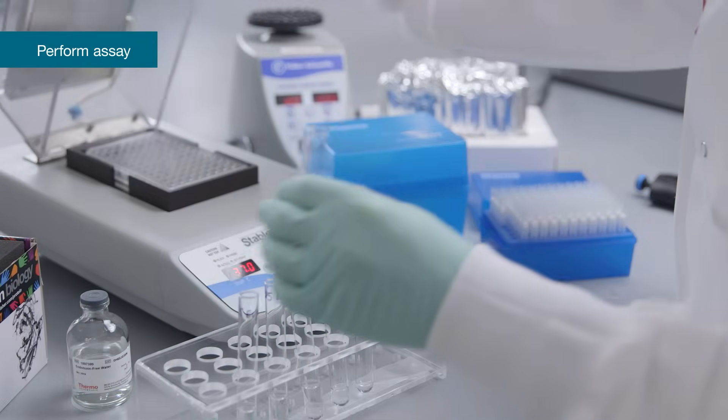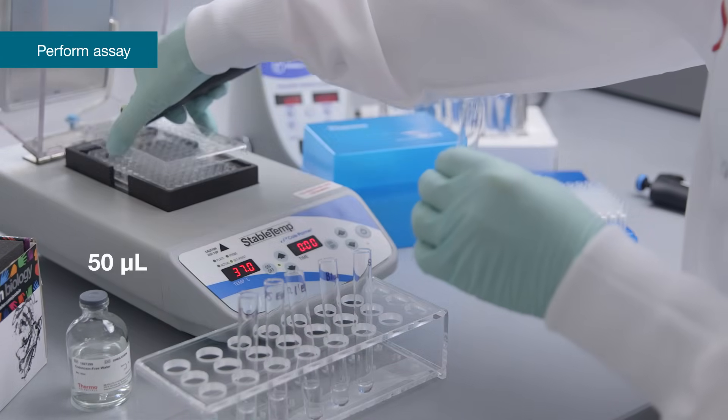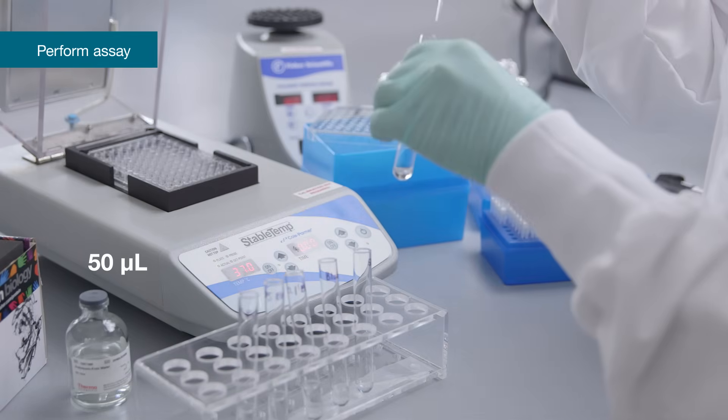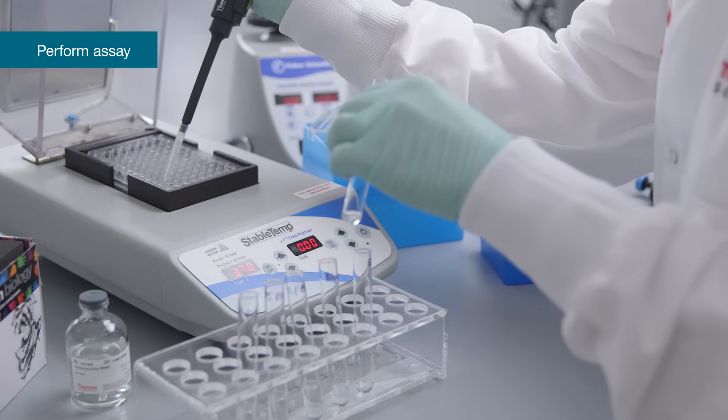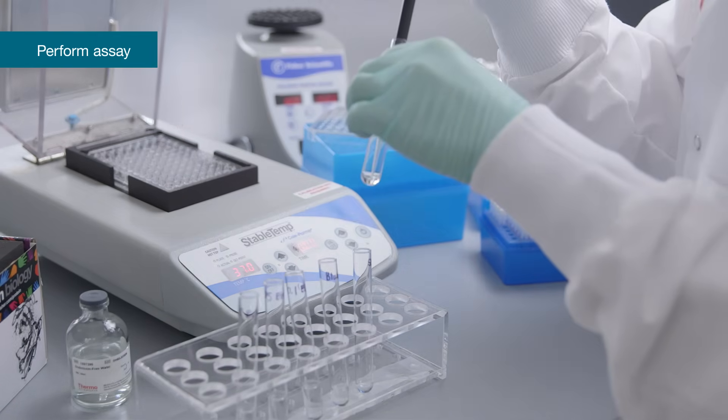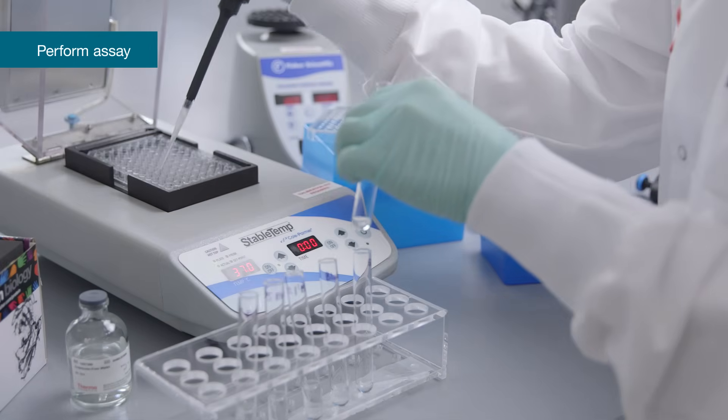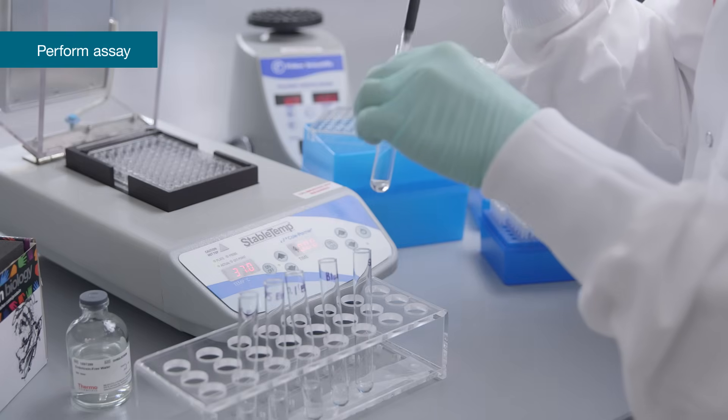Add 50 microliters of endotoxin standard dilutions, blank and samples per well in triplicate. Ensure pipetting order and rate of reagent addition remain consistent from well to well and row to row throughout the procedure.